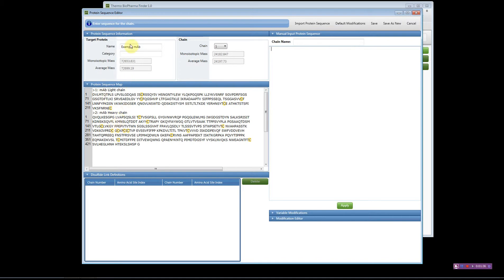The name from the FASTA file is automatically read into the software, so you have a name for your protein. You can categorize this using any terms you'd like — for example, 'peptide mapping' if this sequence is intended for peptide mapping, 'intact analysis,' or perhaps this might be your standard protein.